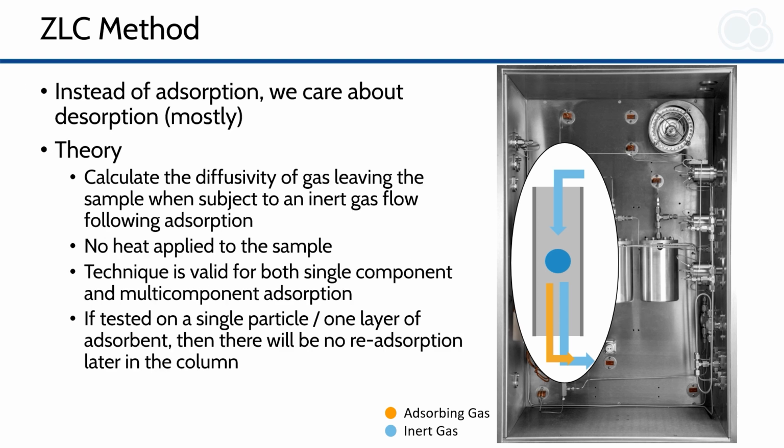For the ZLC method, as I mentioned before, we're mainly looking at the desorption end. We still need to do the adsorption, obviously, but for the data analysis portion, we're primarily concerned with desorption.